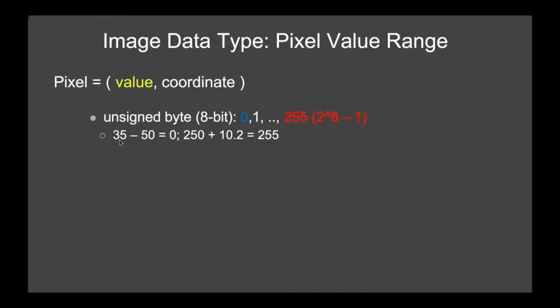So there can really bad mistakes happen if you're not exactly sure what you're doing. Similarly, if you try to add here too much, it will also not work and you will just get a wrong result. And so basically 255 is the highest value that you can get. Another thing is here, this decimal point is also ignored because the 8-bit cannot have decimal points. It's just integer values.